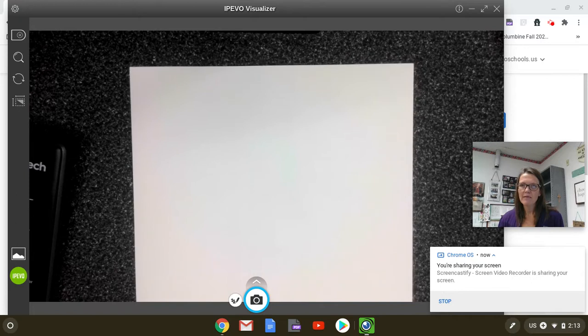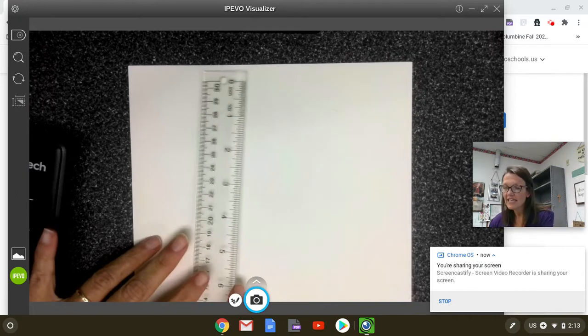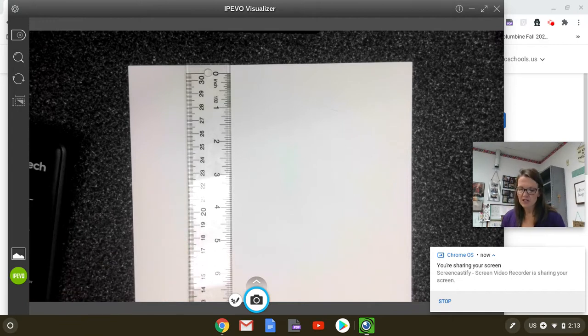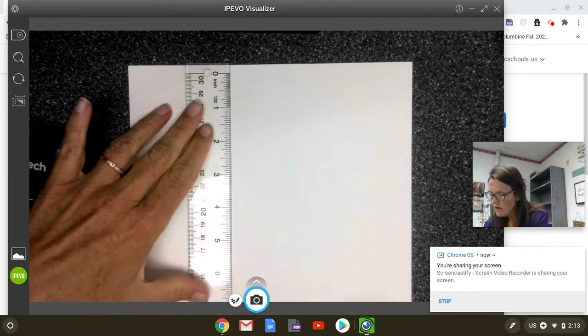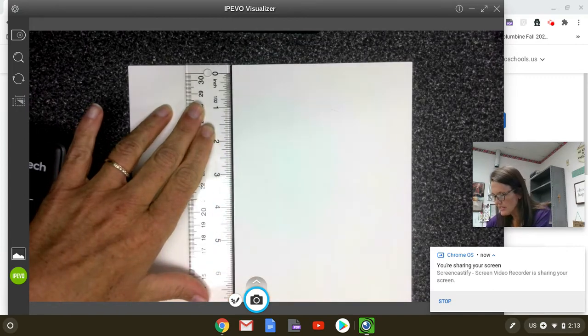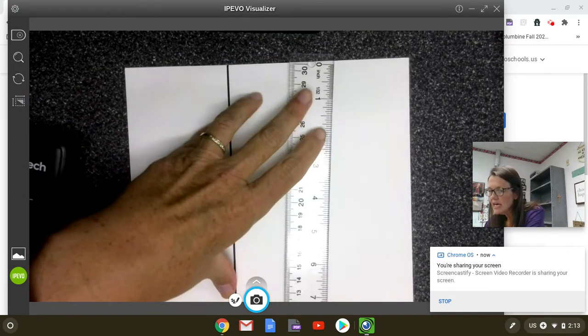So I just have a plain piece of paper and I'm going to divide it into three parts because basically there are three general functions for all lab equipment. Okay, so I'm just going to divide this into those three parts that I mentioned.